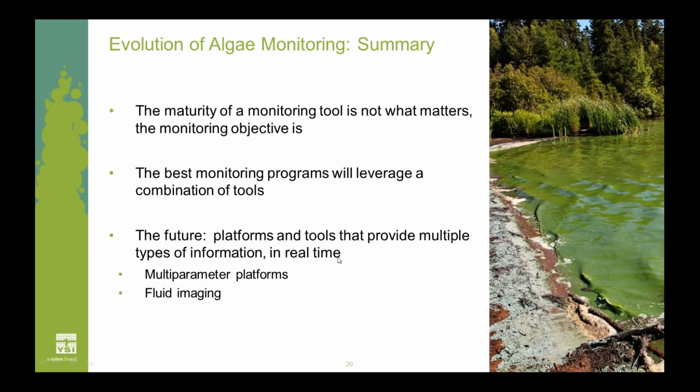So let's sum up this section. I want to leave you with a number of points. First of all, just because a tool is old doesn't mean it's not useful. And I hope people are that way too, now that I think about it. I don't want people to think that microscopes are going to be going away anytime soon because of these newer technologies that are coming on board. The best algae monitoring programs use multiple approaches, a combination of these tools, including some things that I didn't even discuss here, like DNA analyses. That is starting to become more popular.